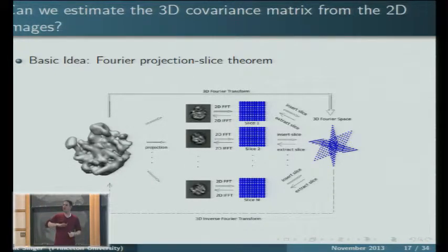So I'm going to look at all these planes that correspond to those two frequencies. And because of the slice theorem, I see now... What does frequency here mean? A point in the 3D reciprocal space, in the 3D Fourier space. Nothing to do with time frequencies. No, so here it is spatial frequency. Okay?